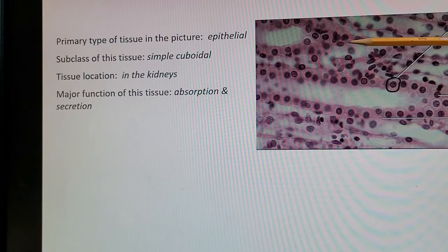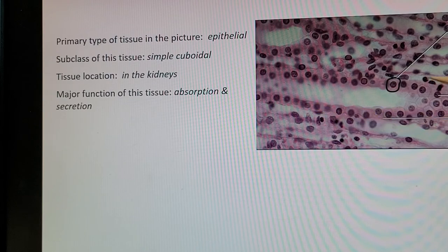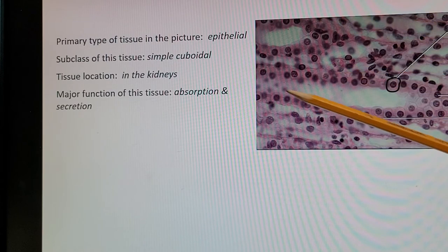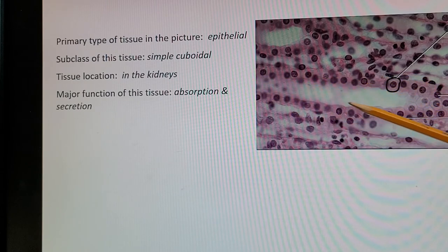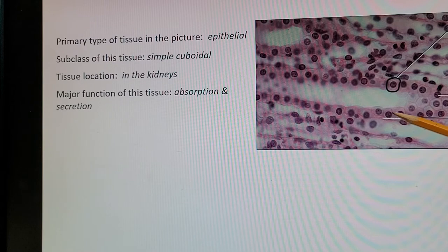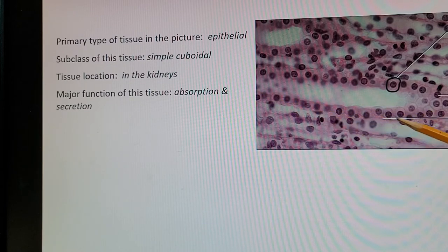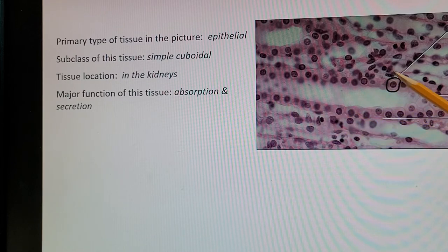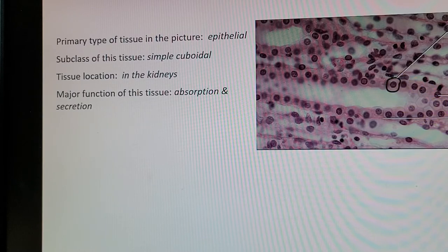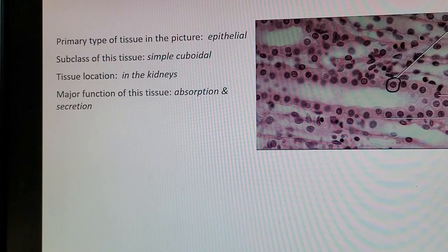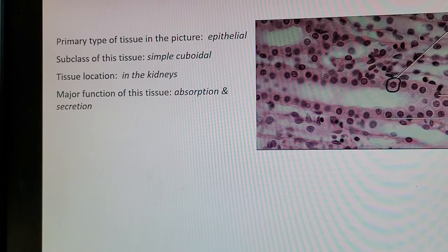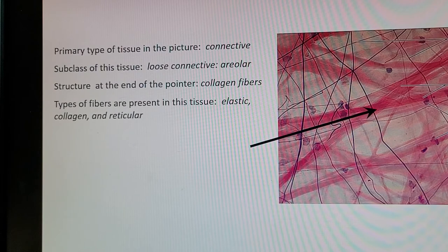Next picture: primary tissue type is epithelial, subclass is simple cuboidal. This tissue is found in the kidneys, which have different tube shapes that help filter blood and create urine. The basement membrane is present, it's one layer of cells (simple), and the cells are equally as wide as they are tall — cuboidal. The major function is absorption and secretion: absorbing what you want to keep and secreting waste as urine.